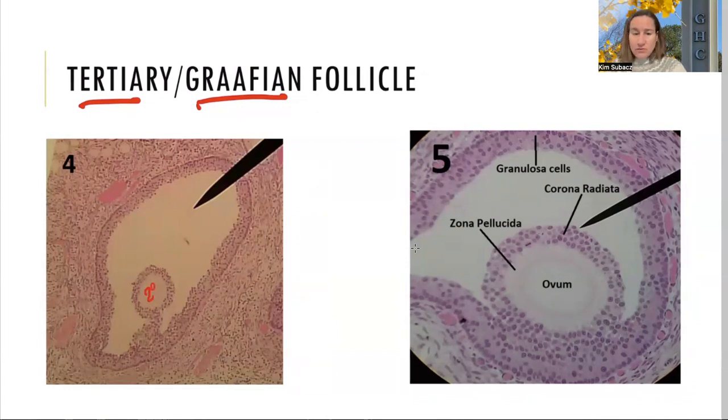Look at this follicle development. That follicle looks beautiful. It is very large, big, very much stratified, lots of layers in there. Look at this nice, clear, well-defined antrum on this. This is a mature Graafian follicle.